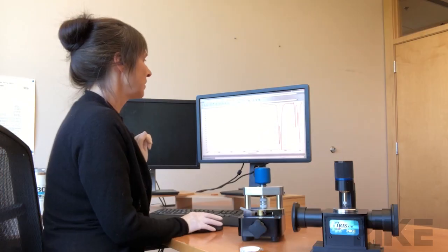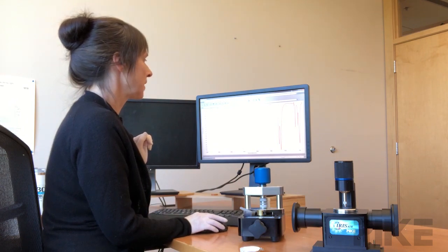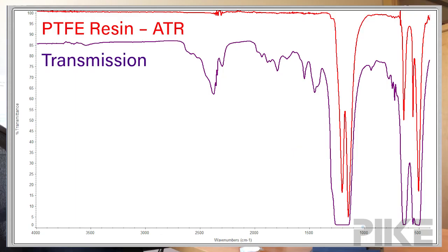So let's add in our transmission spectrum and now you can see we have some saturating bands but we're also seeing a lot more information.